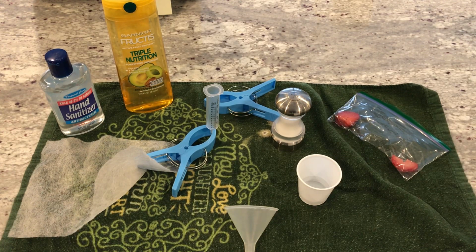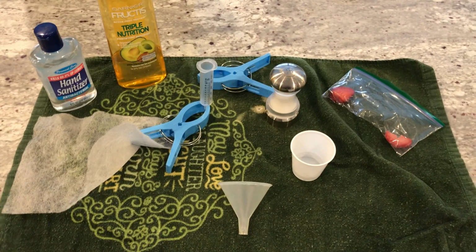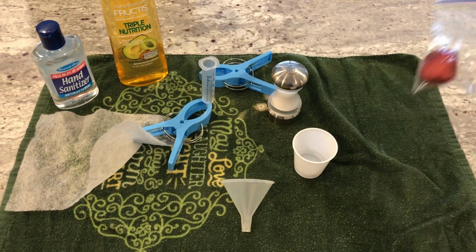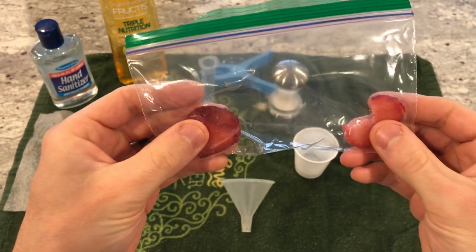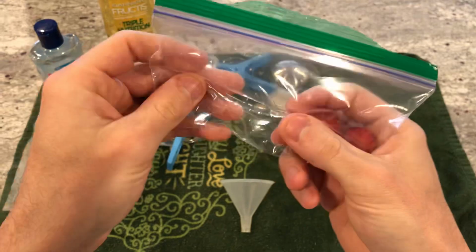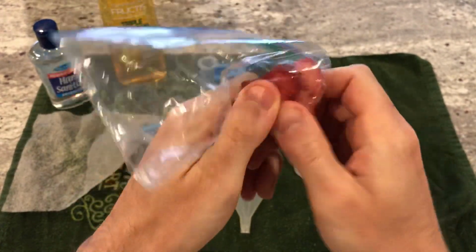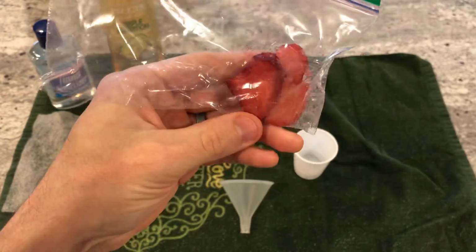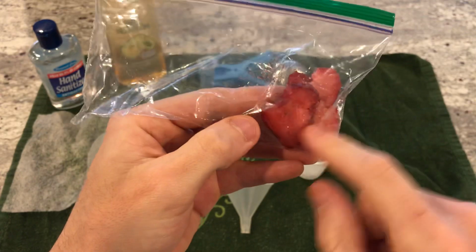Okay, what you're going to do is, you might have done this lab before. You're going to extract DNA from a food source. The lab typically calls for a strawberry, but you can choose a vegetable, a different type of fruit, something. And the whole point is getting different results. The interesting part, what we'll post our results, is what you can get DNA out of. But so you're going to take your source of DNA.